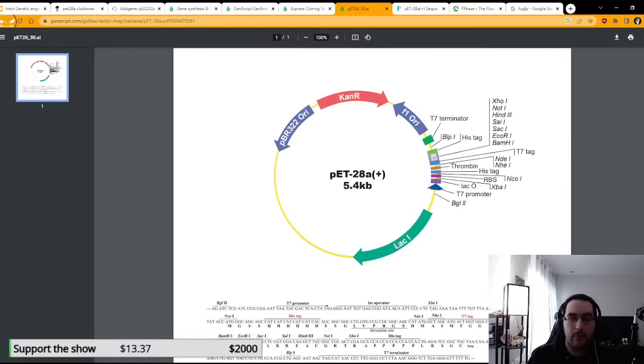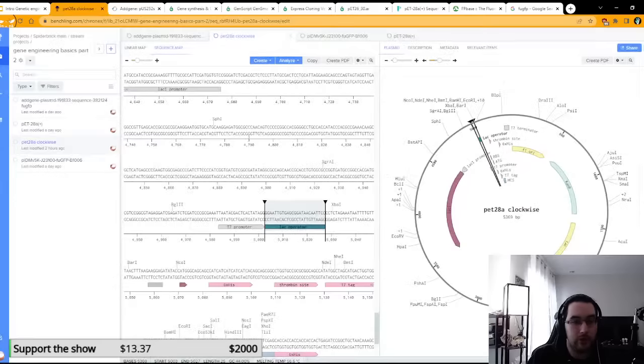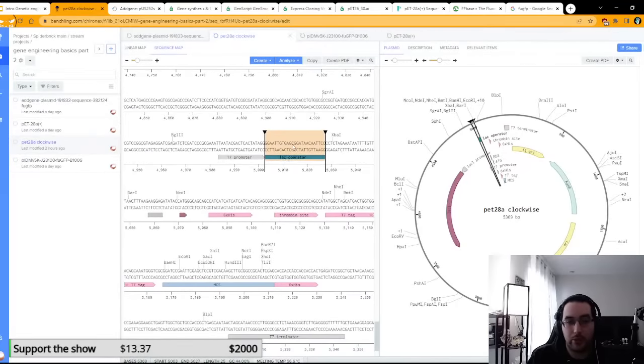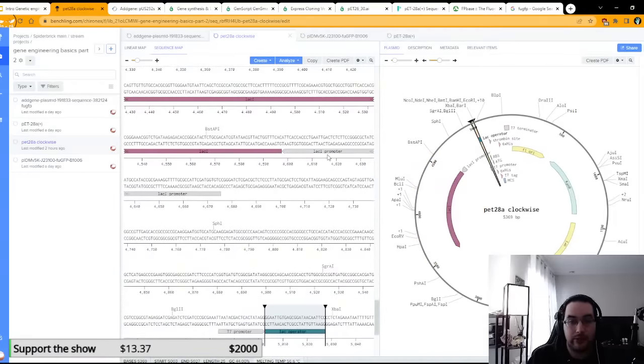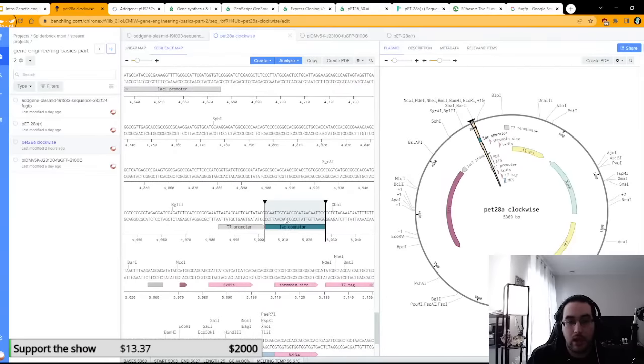So this plasmid is built to be inducible. We're going to break the inducible part later as we get into the coding, because I don't want this to be inducible, but I wanted to show you what inducible code looks like. This protein is constitutive, so it's on a promoter that is constitutive. This protein is always being produced. This protein can actually detect lactose. Do you see how this says lacO? I'm going to go back to the code so you can see this. This is lacO, the lac operator. So this lacI protein physically binds to the lac operator here and basically prevents the DNA from being read.